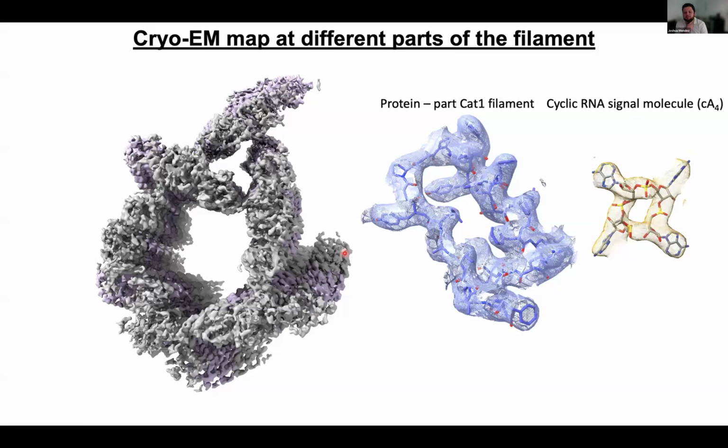Okay, so good. All right, so we have more questions coming in. This is the next one. Could you comment on any preferential orientation that you observe? It seems filaments have a distinct directional preference, but your 3D models are looking pretty good. So do you have any preferred orientation?